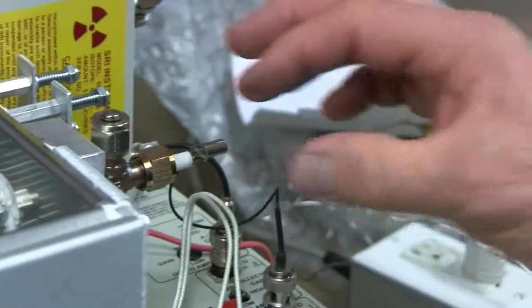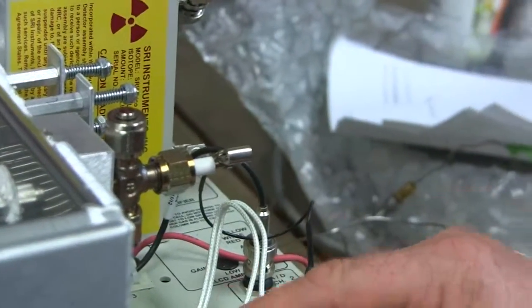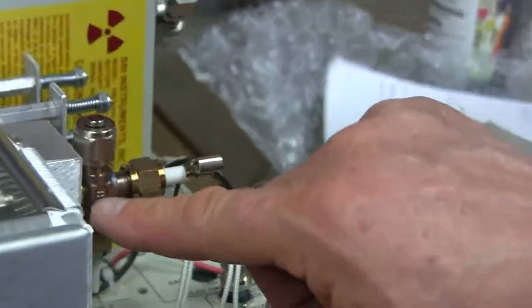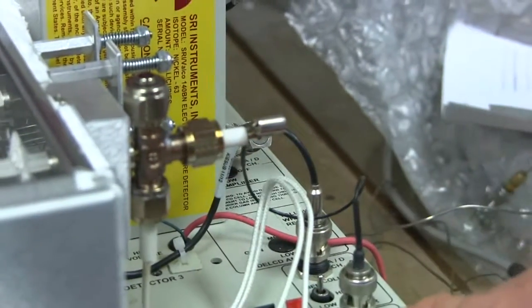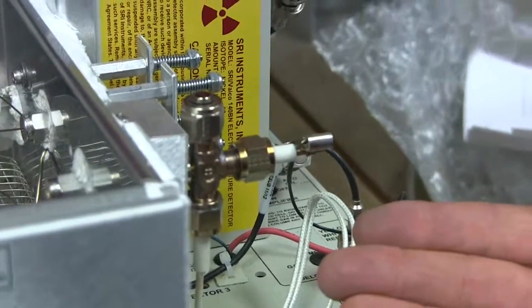This detector here is the flame ionization detector. This detector has a tiny little hydrogen flame right in the middle of this fitting and ionizes the sample by the heat of the flame.